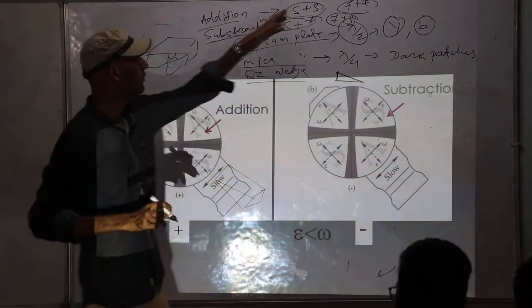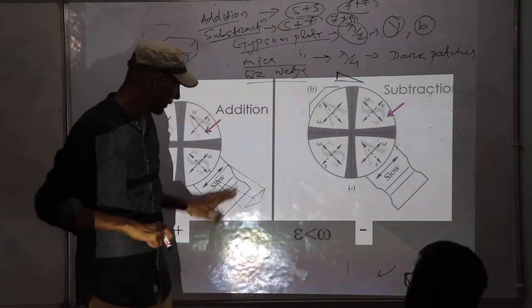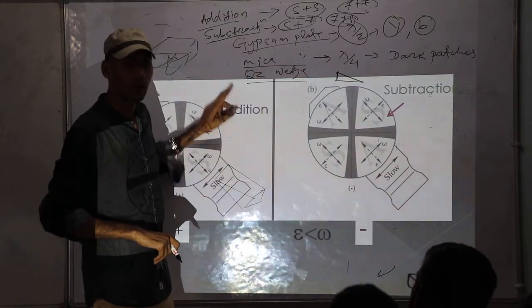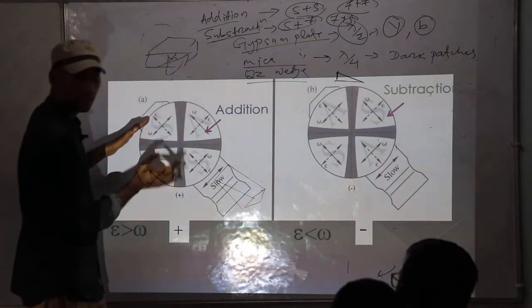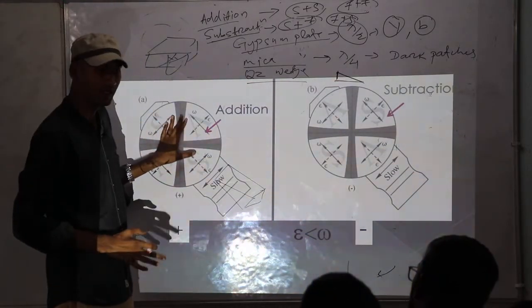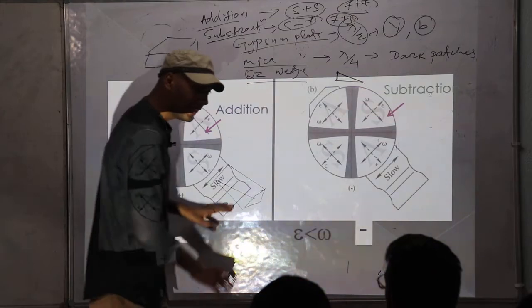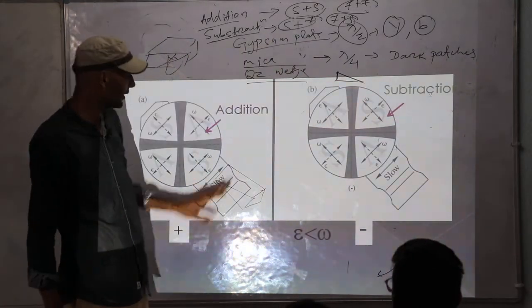Now, talking about slow plus slow, what are the two slows? One slow is for the mineral vibration direction. One slow is for the accessory plate vibration direction. The accessory plate is a mineral. Gypsum is a mineral. Mica is a mineral. Quartz is a mineral. Right? The accessory plate also has two vibration directions, one slow, one fast. Likewise, the mineral section we are viewing on the microscope stage has two vibration directions, one slow, one fast. One of them is slow, either O or E, depending upon positive and negative. Similarly, for the accessory plate, the vibration will also be slow or fast.